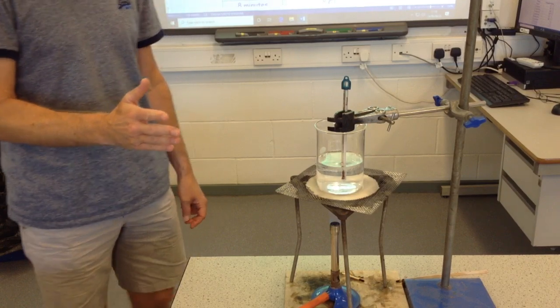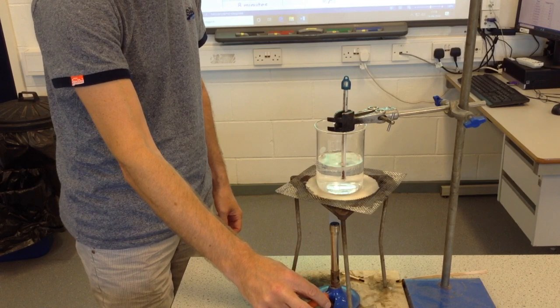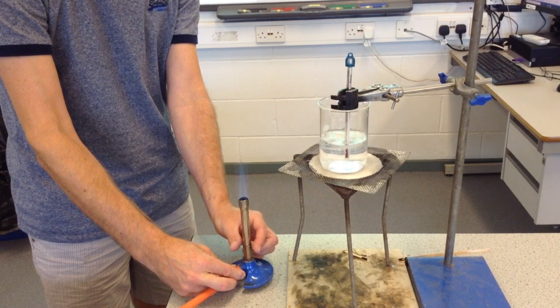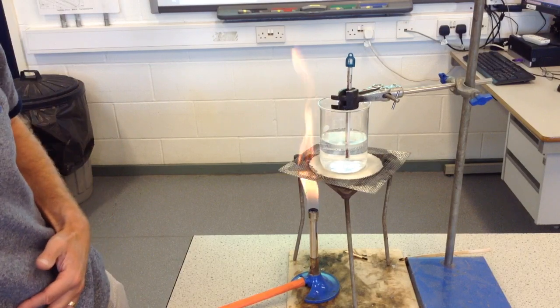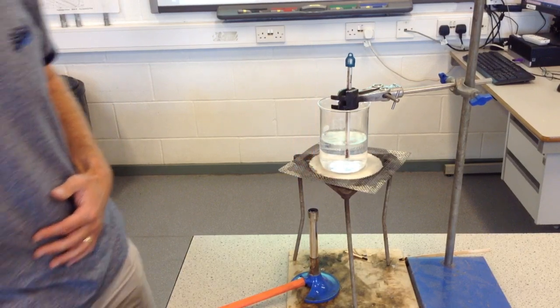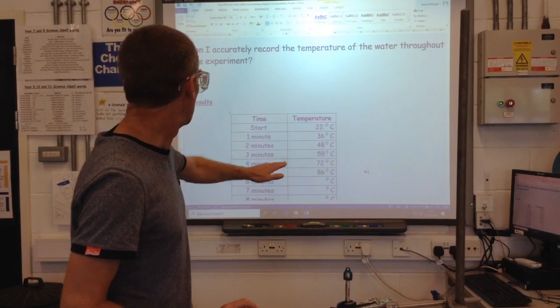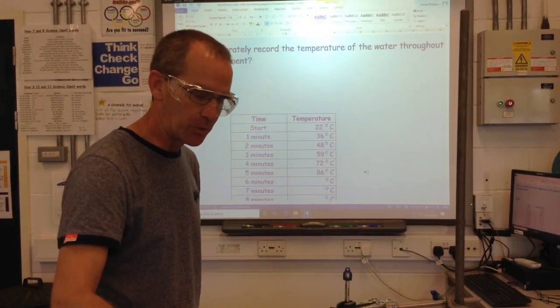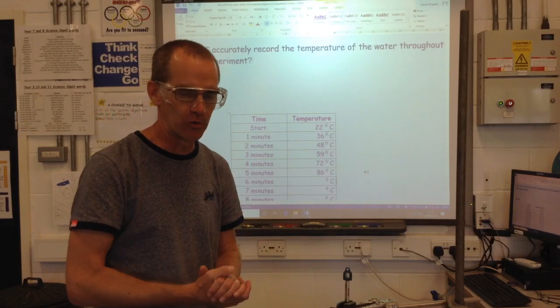I'm deliberately going to stop the experiment at this point. I'm going to turn my Bunsen back onto safety flame, turn it out, and turn the collar back to the safety flame, then turn it off at the gas tap. Now packing away — of course we'll have to wait. There's no way I'm going to touch any of that at the moment. We know that it's 86 degrees — the water, the glass, the top of the tripod. I can feel the heat coming off right now, so there's no way I'm even going to think about touching any of that for a while.